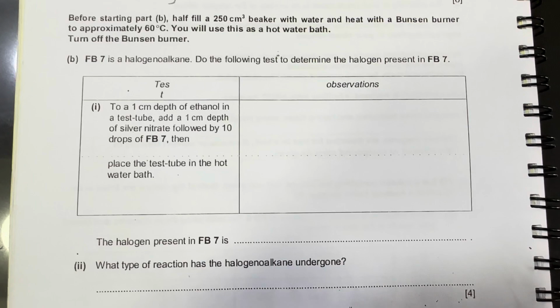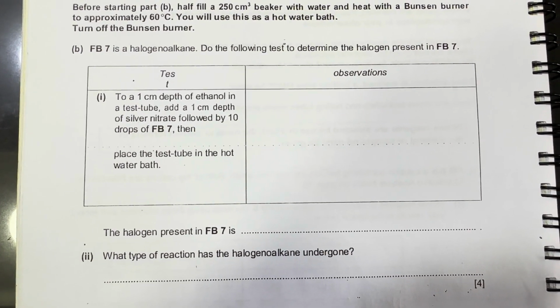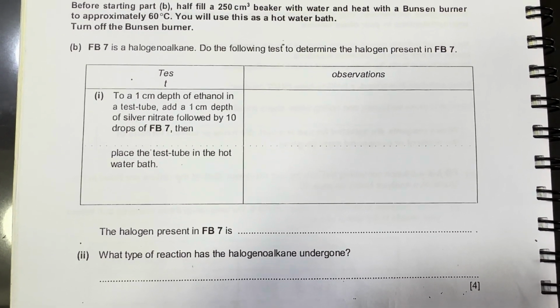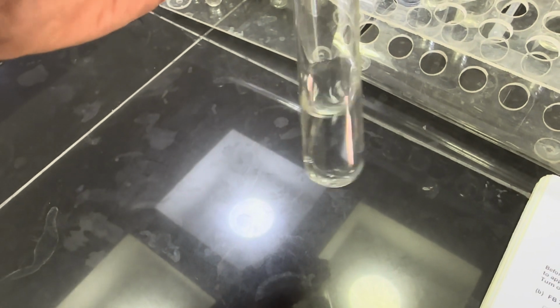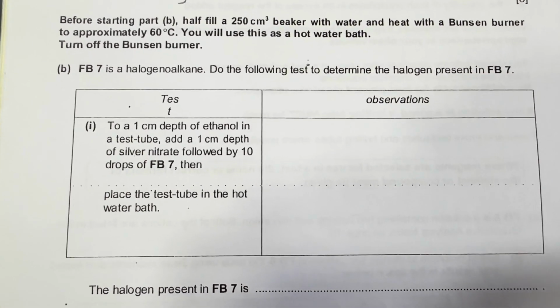Moving on to this part B, in which they have said FB7 is a halogenoalkane. Do the following test to determine the halogen present in FB7. Now the solution which they have given us here, FB7, is a colorless liquid, and we will see which halogen is present in this by testing in this way.